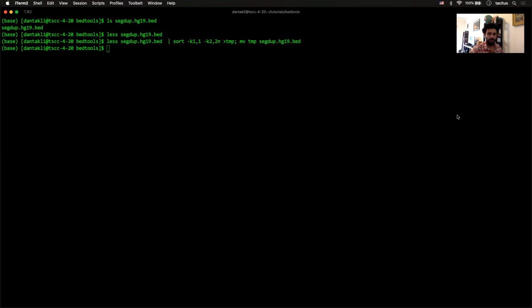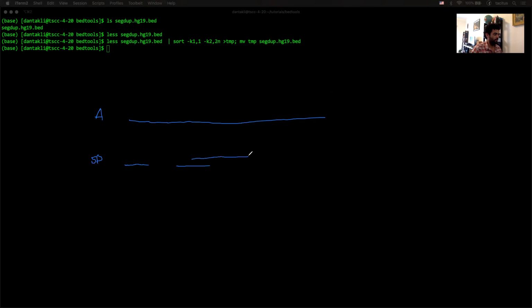So sometimes we have a situation where you have a variant that is rather large, like this, like a deletion or something, right? And now you have your seg dupes, and say I have a seg dupe here, a seg dupe here, maybe one like this, because there are some overlapping positions there, and maybe one like this, right? And maybe make this a little bit longer, just for the sake of argument.